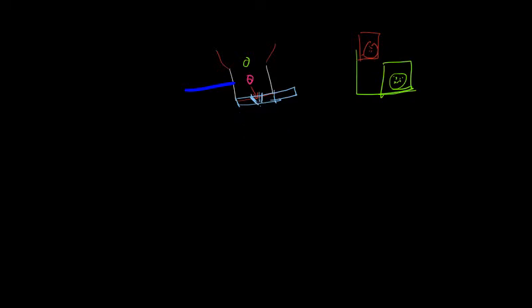There are two purposes of the nozzle. One is that we have control over the stream, and number two, the nozzle is used to vibrate. There is a piezo actuator associated with the nozzle, and the nozzle can vibrate. So why do we need to vibrate the nozzle at all?